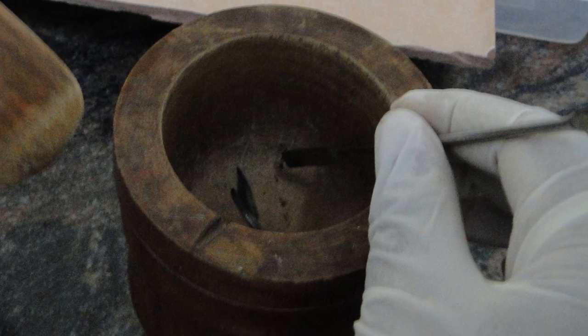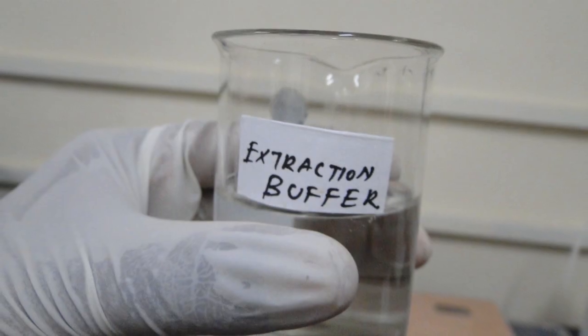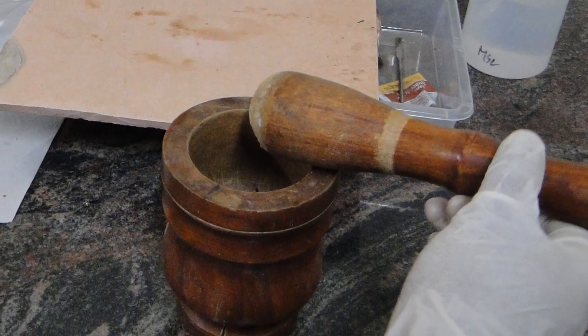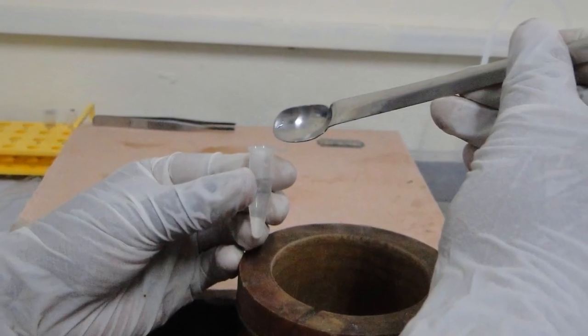Procedure: Cut a small portion of zebrafish fins and put it in a mortar. Add 600 microliters of extraction buffer from icebox to the mortar and make it into a paste. Transfer this paste into a new vial.